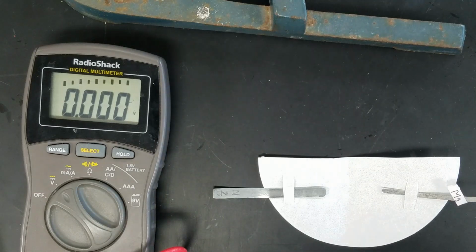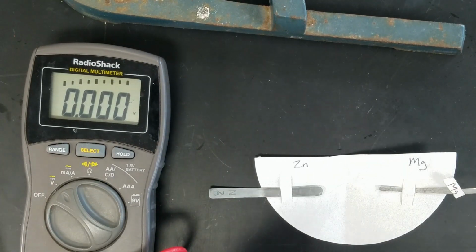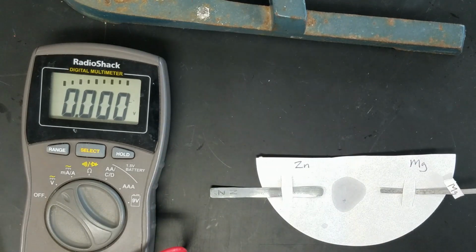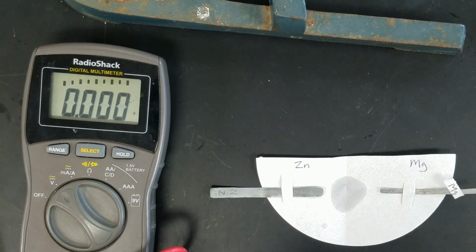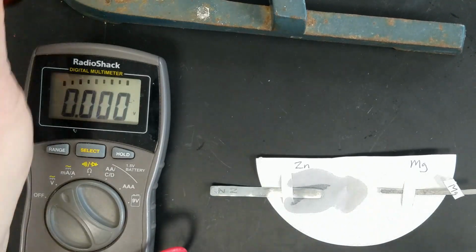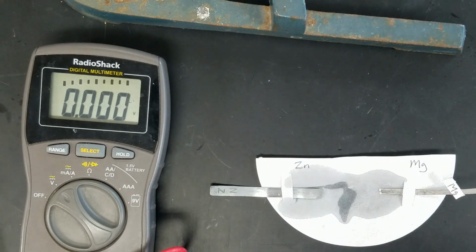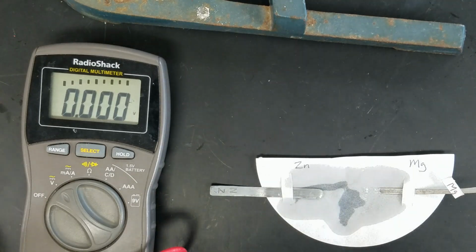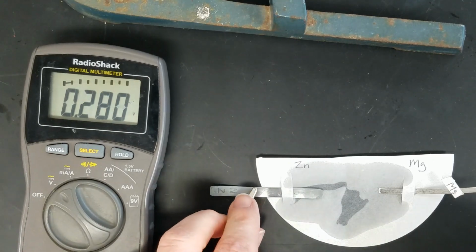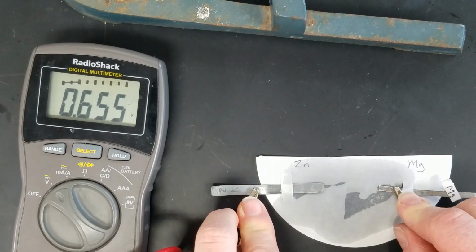We're now going to try zinc versus magnesium. We're going to add our salt bridge to the center, put our zinc solution on our zinc side, and add magnesium solution to the magnesium side. Now the magnesium oxidizes pretty readily, so I've had to sand down the magnesium so that it makes good contact. And so you want to record the voltage for this cell.